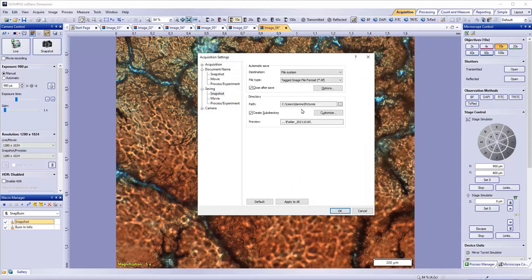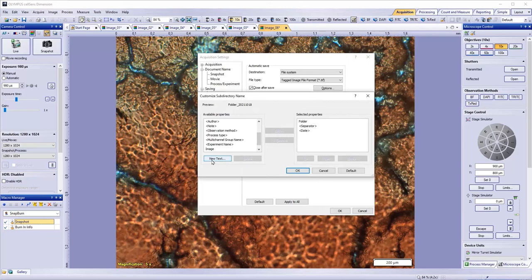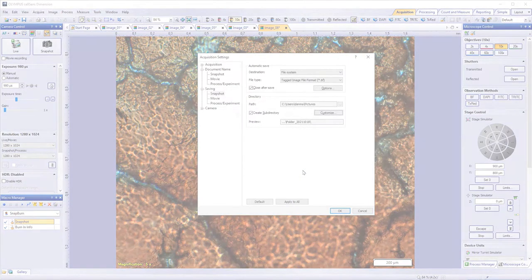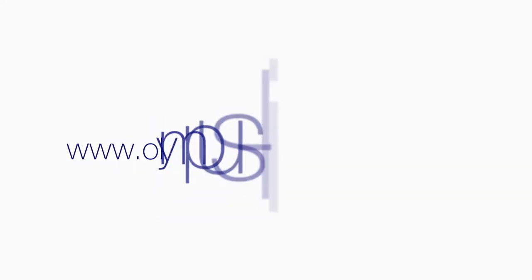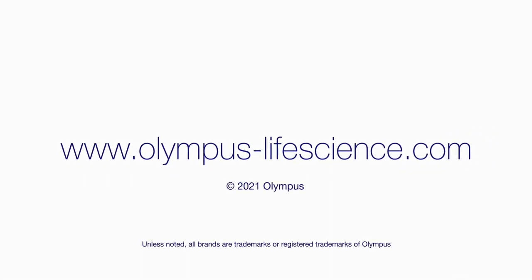To change the subdirectory's name, click the Customize button to see the available criteria, or click the New Text if you want to add your own. For more information, visit olympus-lifescience.com.